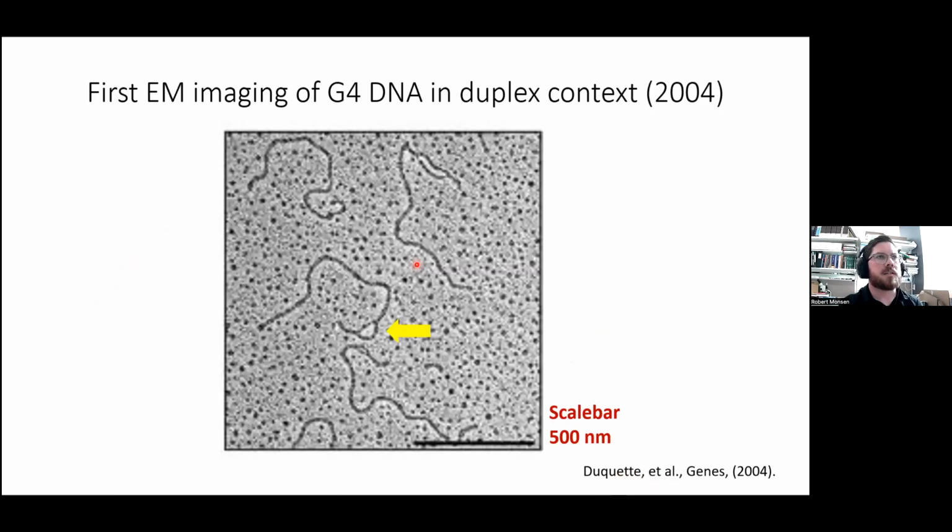However, this is the main micrograph from that study, and you can see that there is a bubble where they have done in vitro transcription. They formed the R loop and displaced what in one case is the G loop, but the resolution is so poor that there's nothing actionable here. There's no way to build a model against this. It's also up for debate if they even see quadruplex formation there.